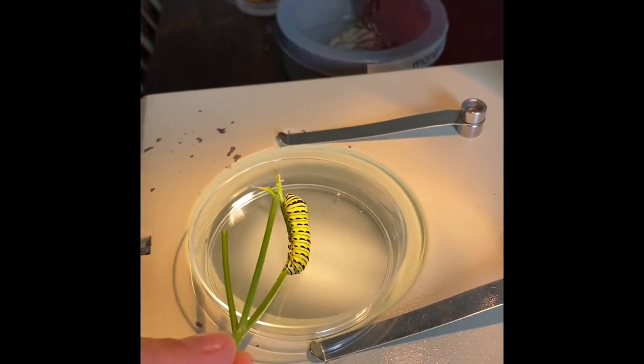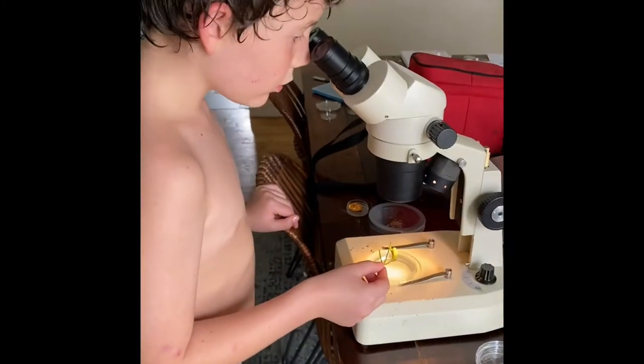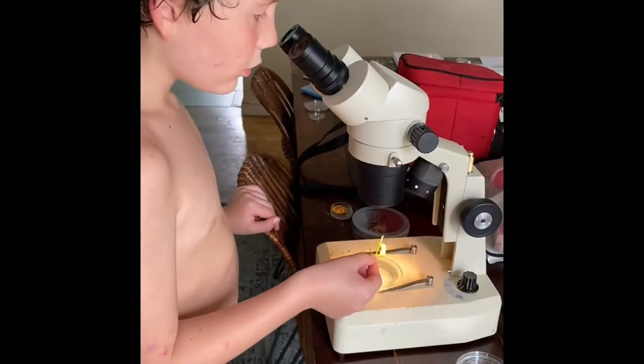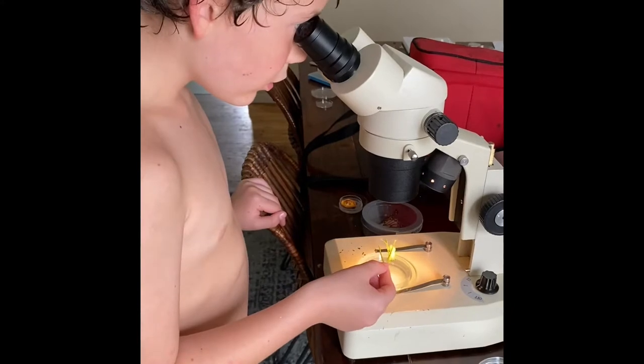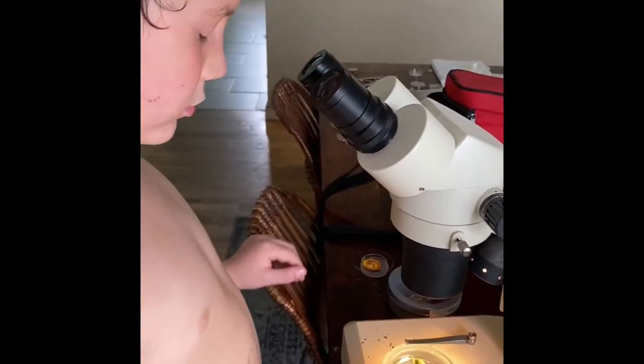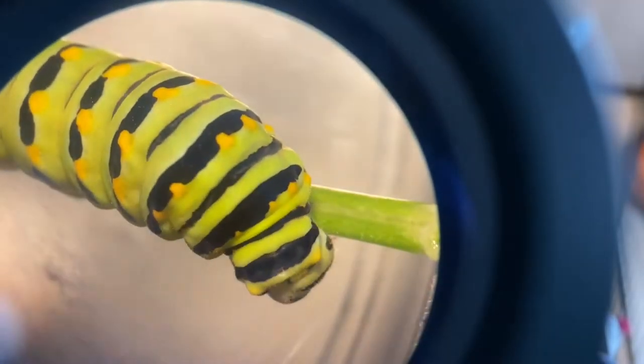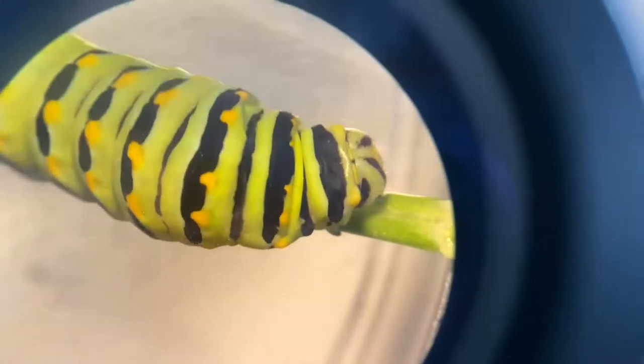This is a stereo microscope — it's a microscope that doesn't zoom in super closely, but I'm gonna try and get a cool view of this little caterpillar so everybody can see it. This is an image up close of this little swallowtail caterpillar through the lens of our stereo microscope. It's a little hard to keep the camera on it properly.